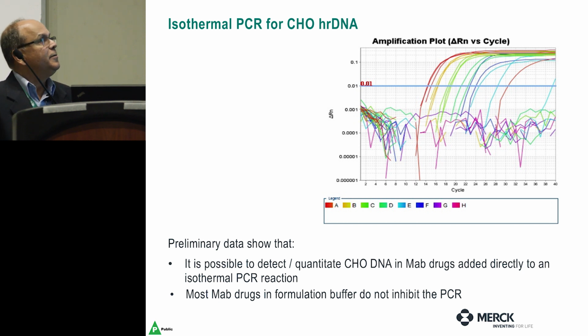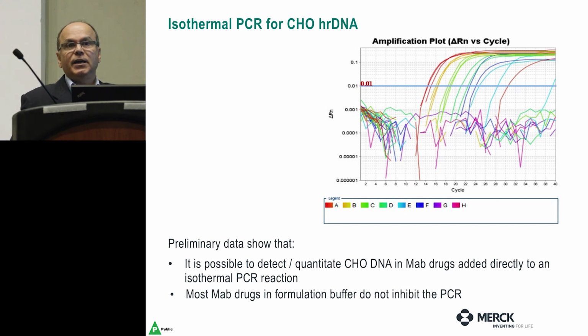With qPCR, we are able to do isothermal PCR instead of thermocycling. We are able to amplify the DNA in the drug mixture.